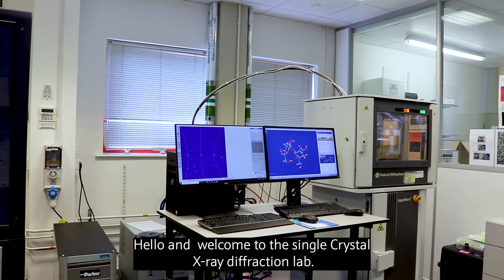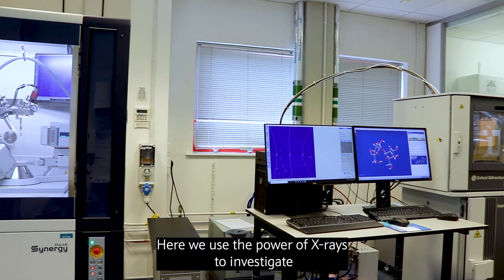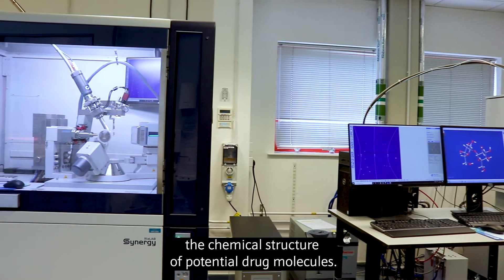Hello and welcome to the single crystal x-ray diffraction lab. Here we use the power of x-rays to investigate the chemical structure of potential drug molecules.